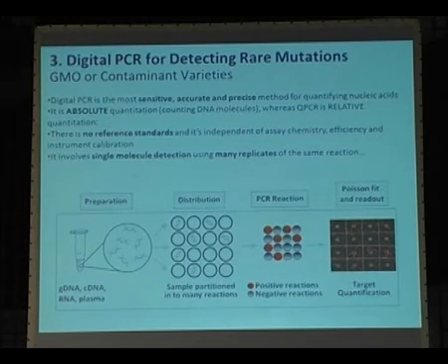Of course, being able to detect and quantify a sample in terms of copies per microliter is a lot more standardizable from laboratory to laboratory than, for example, a delta-delta CT value.